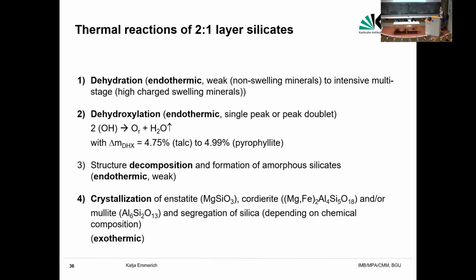In the case of pyrophyllite and talc, no swellability, so we see a very weak dehydration peak. The same for illite and micas, non-swellable clay minerals. In the case of smectites and vermiculite, which are swellable clay minerals, we see a very strong peak during the dehydration.